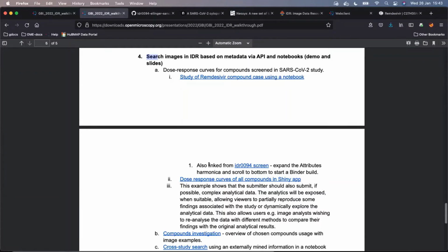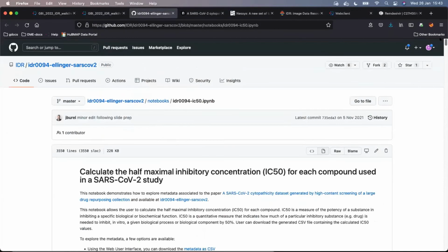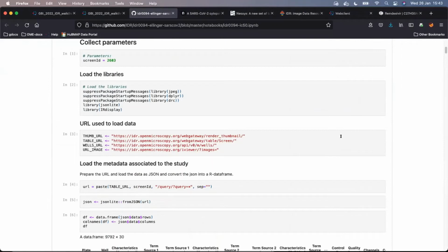One point to clarify, because Alex was mentioning earlier the credentials. In the case of IDR, when you use the UI, you won't need a credential. Sometimes, depending on the language, for that notebook you won't, as Peter is not seeing, because he uses the JSON API. But in some cases, you will find in notebooks some connection credentials already in the notebook. It's public, so there's nothing to hide there. It really depends on the mechanism you use to connect to IDR.